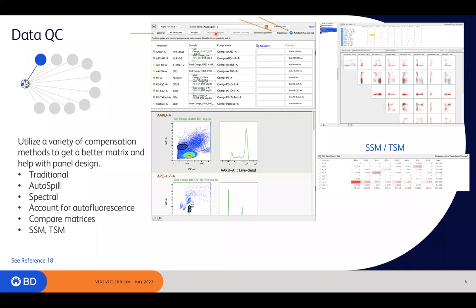to best deconvolute the data. There's also another algorithm that we've implemented in FlowJo, and it's been there for a while now, at least 2 years. This mechanism is called autospill. This is another way to compensate your data that I'm very bullish on, and the reason is the setup. Really, all you need is a gate that has some positive cells in it or beads, and you don't need a negative.